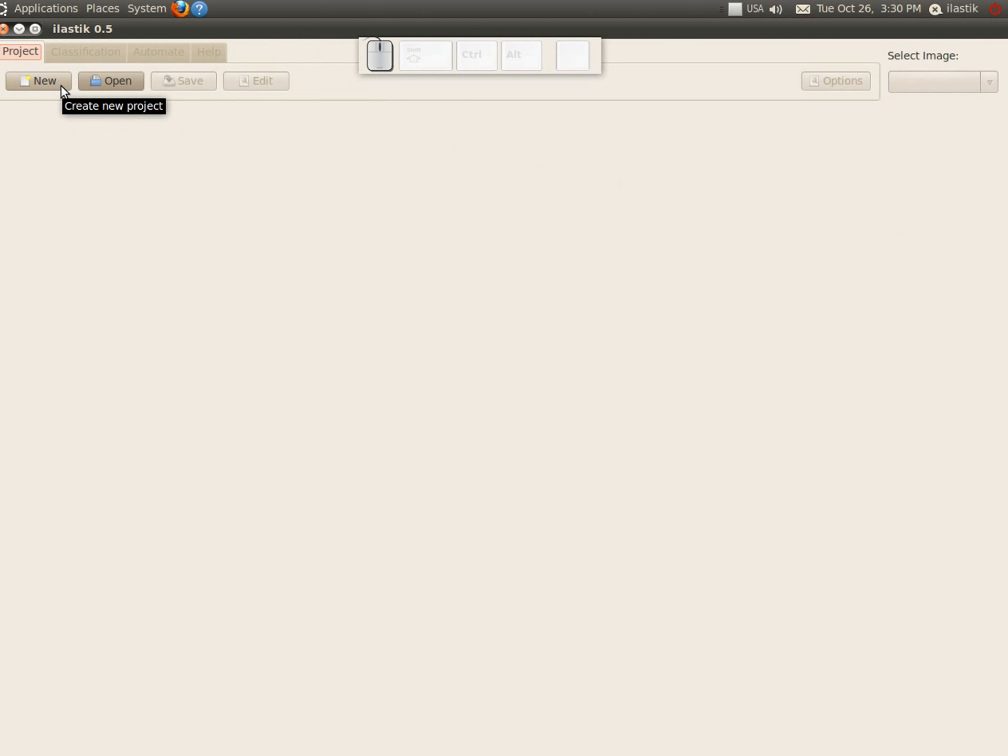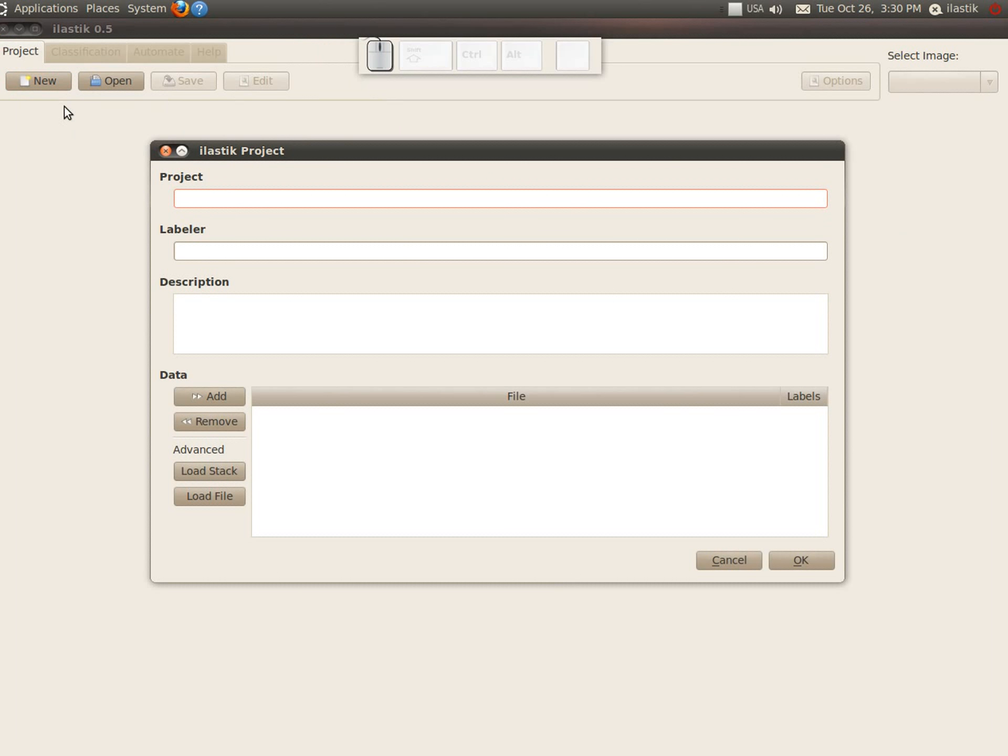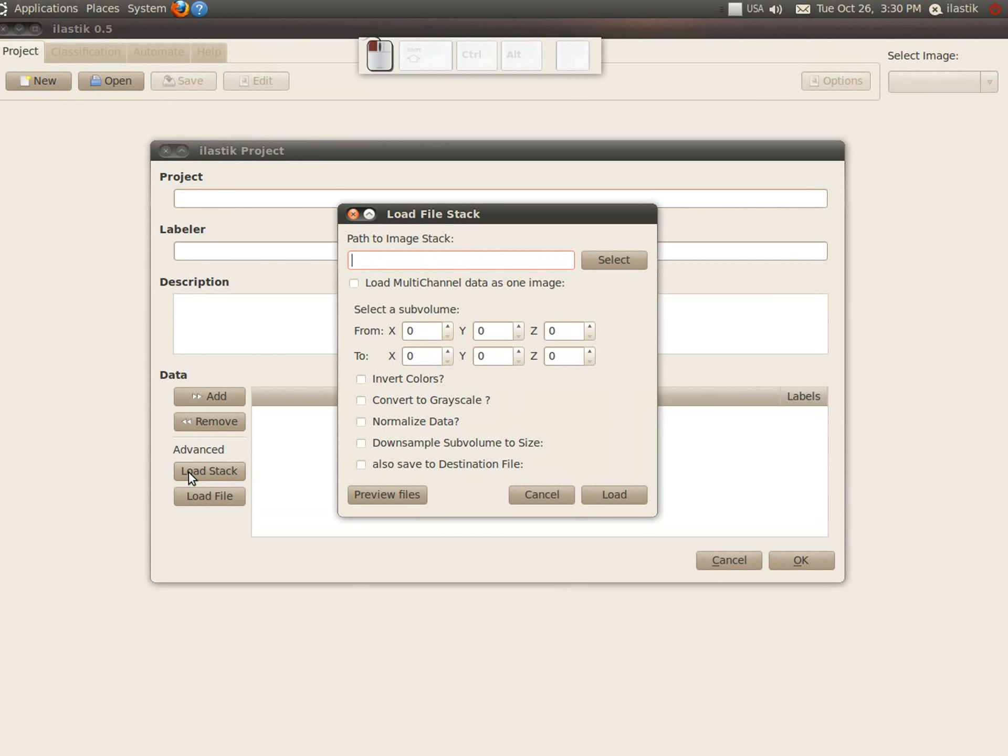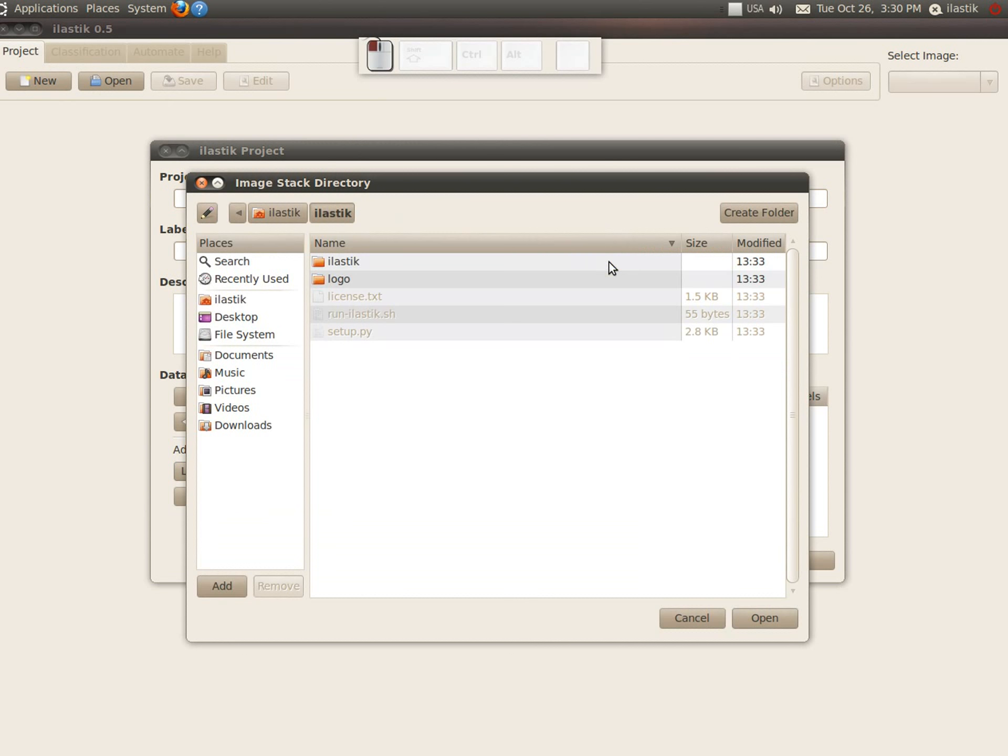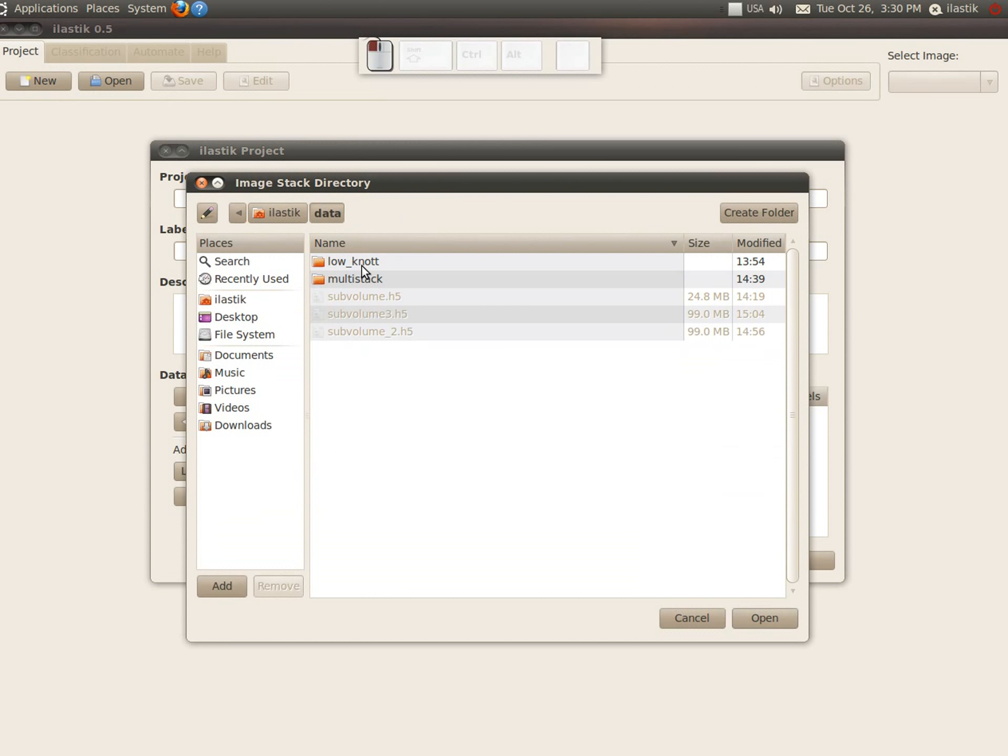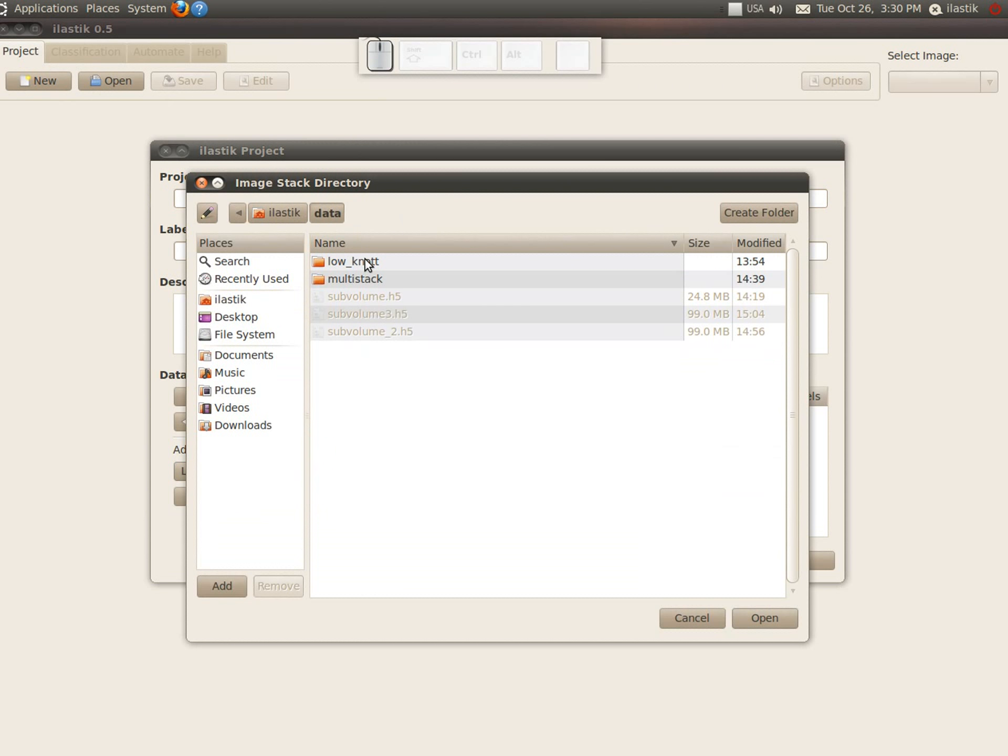So first we go to make a new project, which has the load stack button. Then we can specify the path to where the stack lies. Let me go to the data directory where it is.